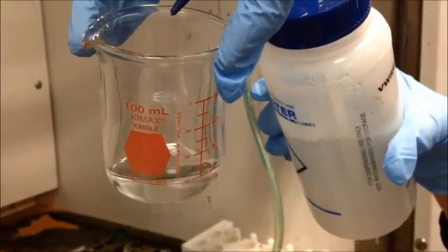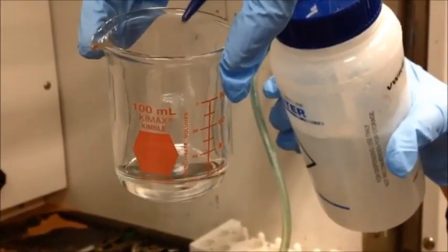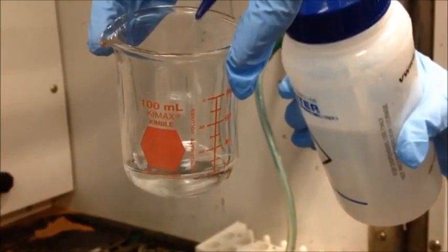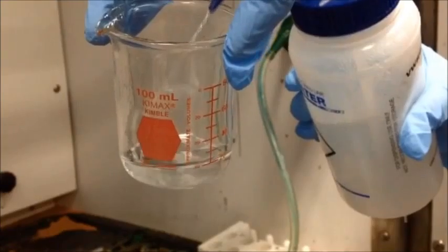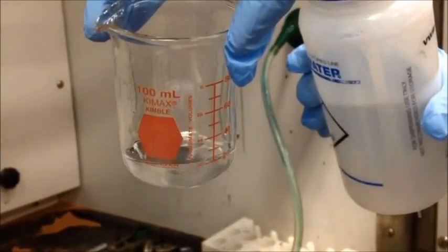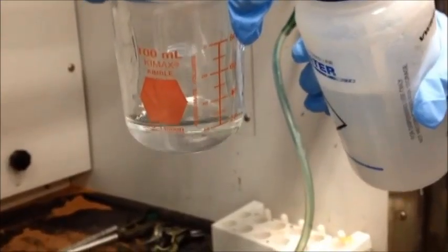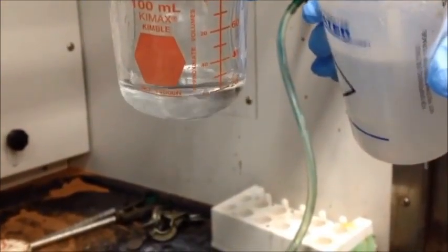Just to double check and make sure that our experiment worked, we performed 2 tests. We first smelled for ethanol by wafting the scent towards us, and it became immediately evident that ethanol was the liquid present. Our second test was adding water to the beaker containing our liquid. This resulted in wisps appearing as the two liquids mixed, which is indicative of an alcohol being present.